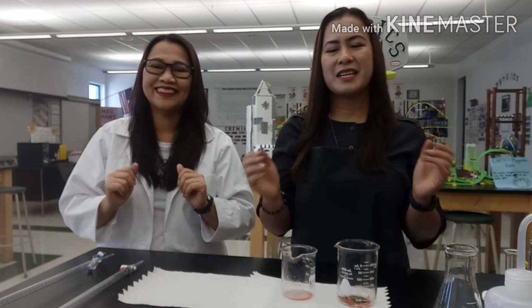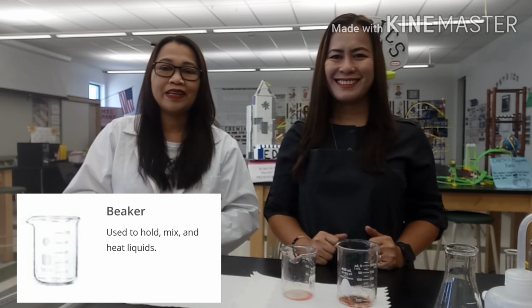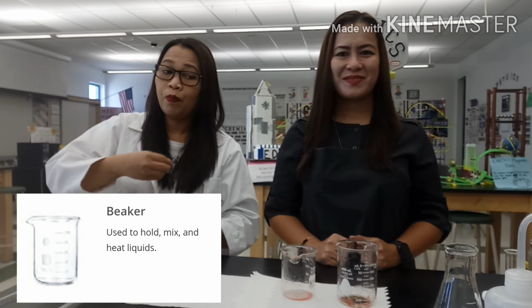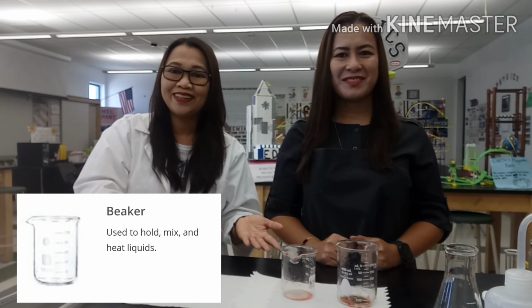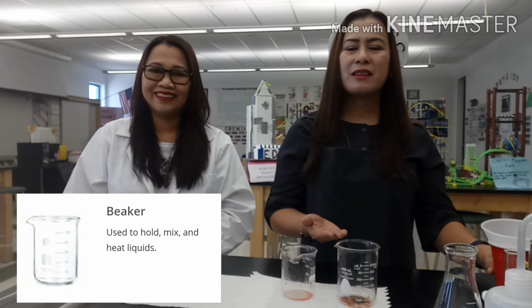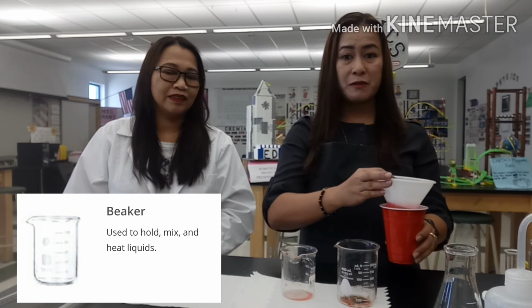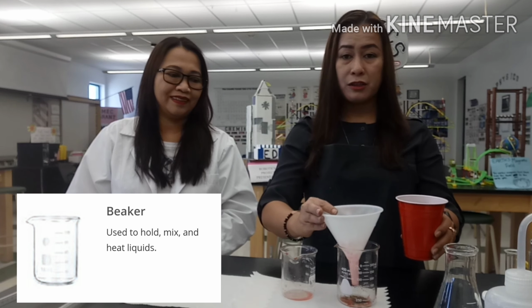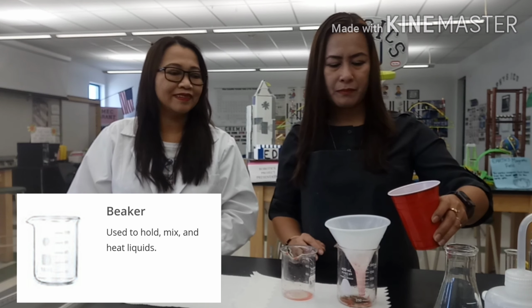Hello everyone, we're here again. We will be showing you how to use your apparatus properly. Here we have now the beaker. The beaker is used to contain liquids, and it is also used to pour liquids from one container to another. For a big mouth container, we normally don't use a funnel, but this time I will be showing you the funnel used while pouring.